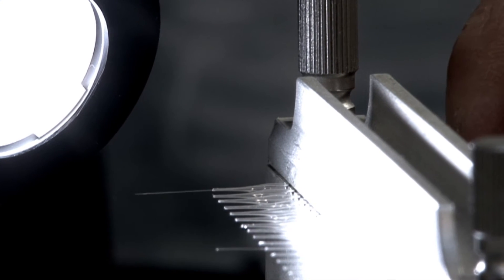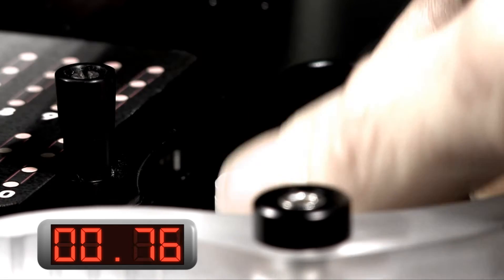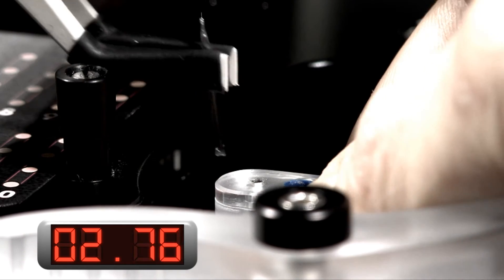We make the needles so you don't have to. They attach in seconds with our quick change tool holder.